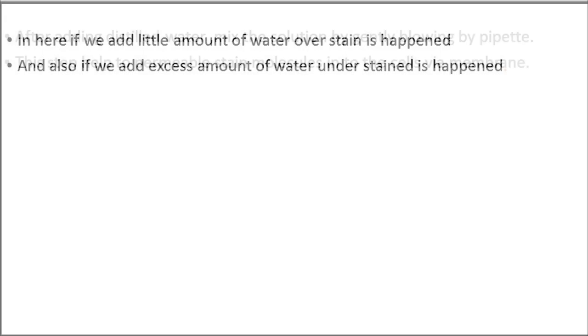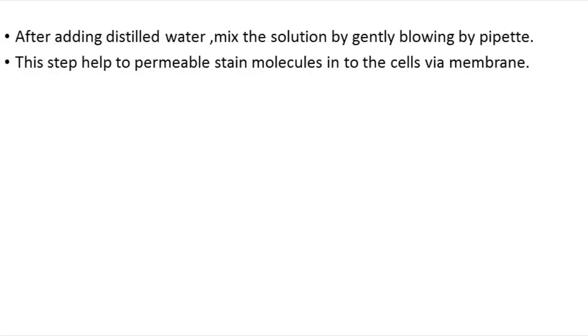After adding distilled water, mix the solution by gently blowing with a pipette. This step helps to make stain molecules permeable into the cells via the membrane.